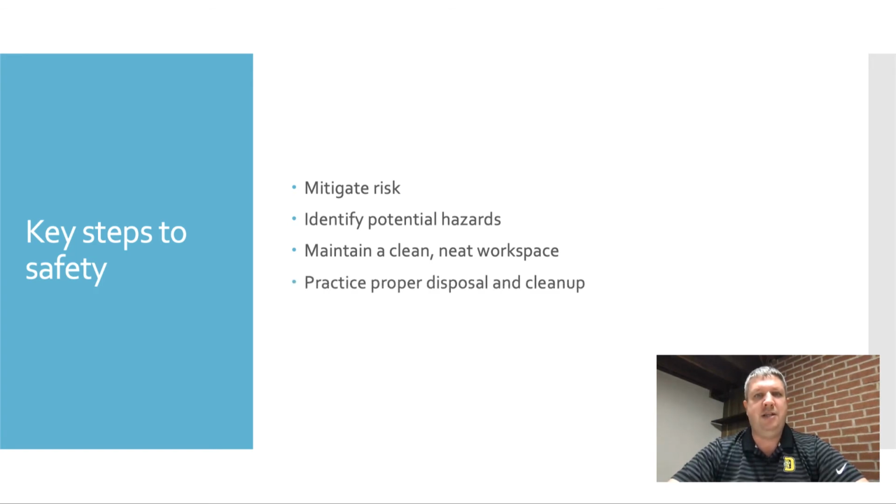You also want to practice proper disposal and cleanup. Hazards can be created if you don't throw things away or dispose of them properly, so you have to be safe during cleanup. You need to store things properly, you need to put them away in the right way. All of these are key steps to operating safely. And because we're just looking to mitigate risk and not eliminate risk, know how to respond in case of an accident. We never want an accident to happen, but we also have to be prepared just in case it does.